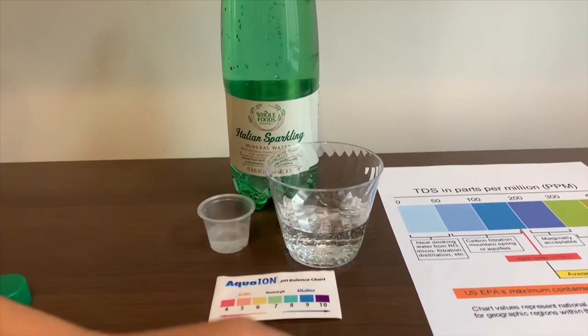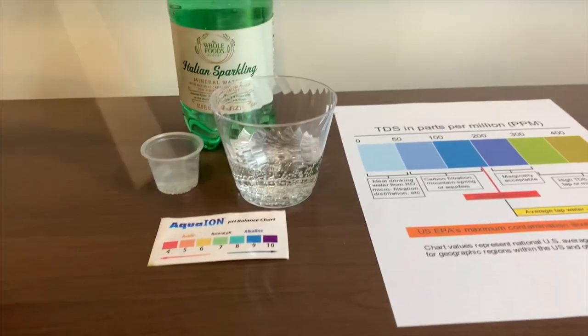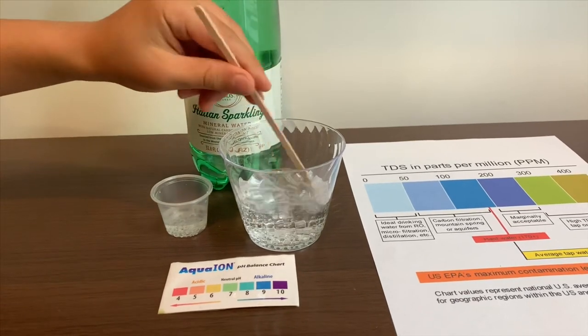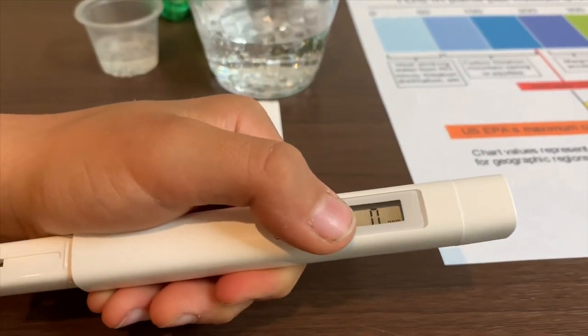First, we're going to test the TDS level. If you want to buy this TDS tester, check the link down below. Let's stir it a little so we'll get a better result. Now, turn on the TDS tester, make sure it says zero, and put it in.